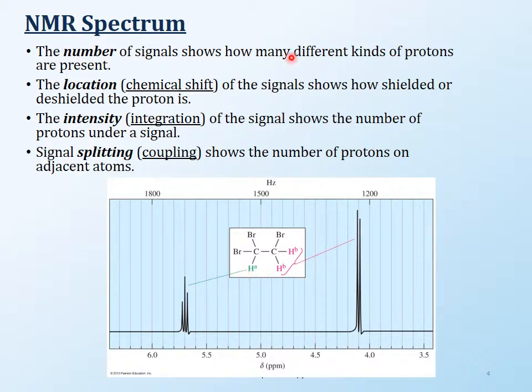Looking at all of the four things that we have just mentioned here, what else would you need in order to determine the structure of a compound?